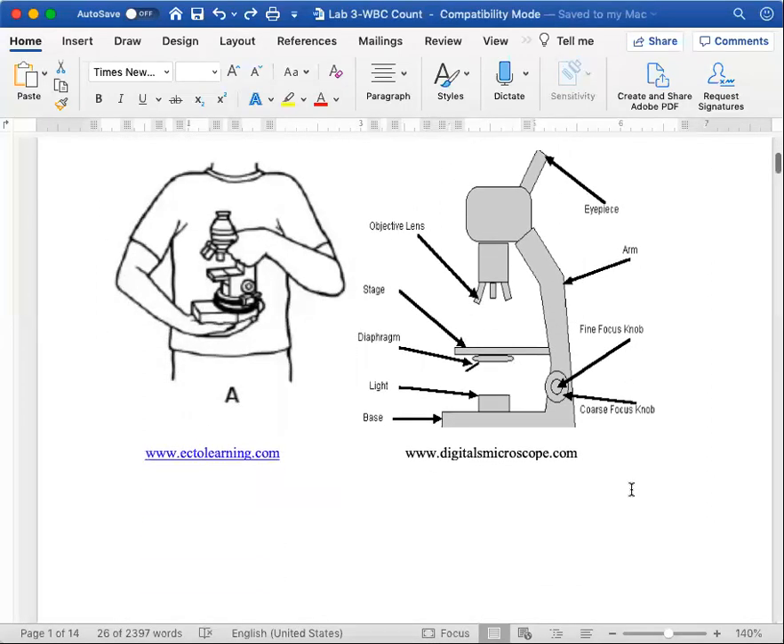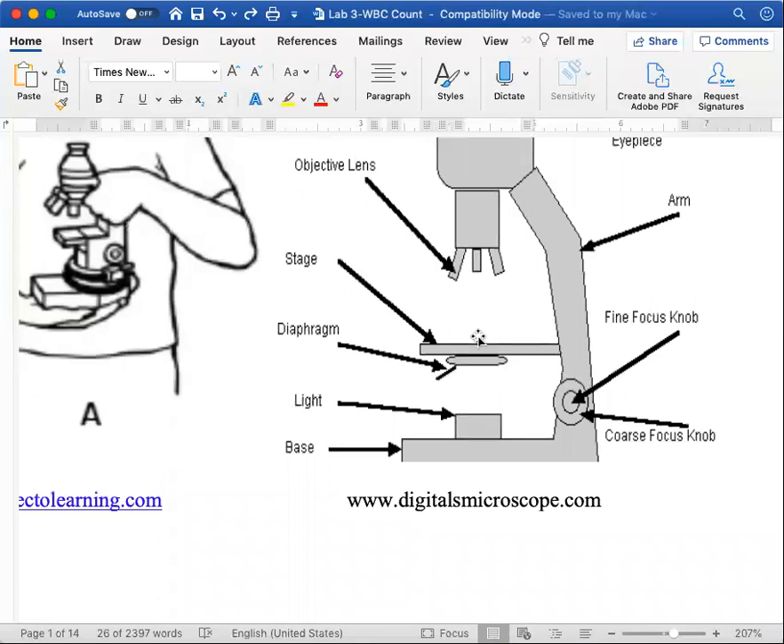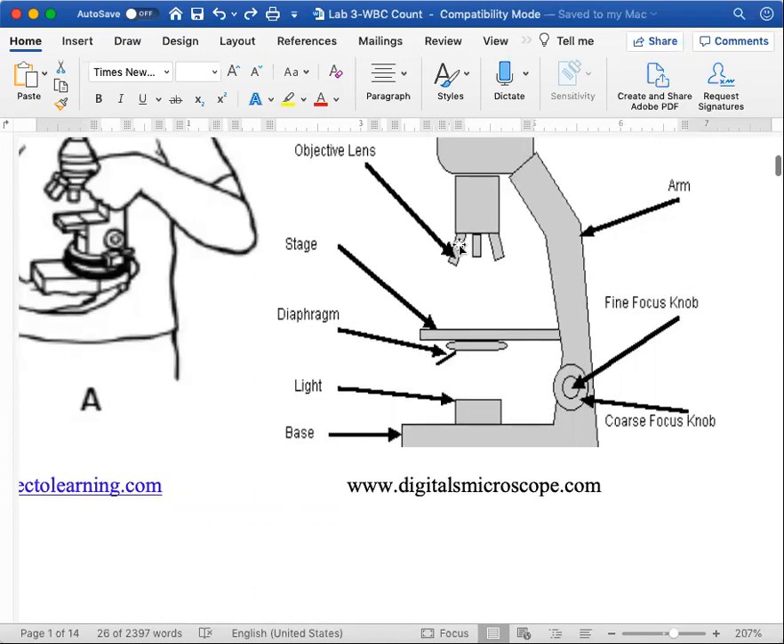The gist of the microscope is you put a slide on the stage and use the lowest objective lens to get it into focus using the fine focus and coarse focus knobs. The lowest lens is the red-banded one, which is the 5x objective. Then you move up to the 10x objective — the yellow one — get it into focus using the fine focus knob, then move up to the blue lens, the 40x objective.